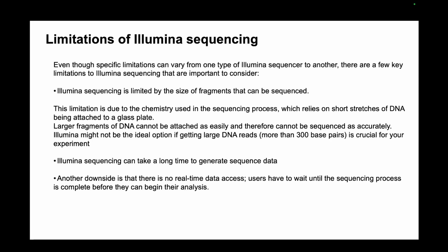Other than that, there are limitations to this type of sequencing as well. Even though specific limitations can vary from one type of Illumina sequencing to another, there are a few key limitations to Illumina sequencing that are important to consider.